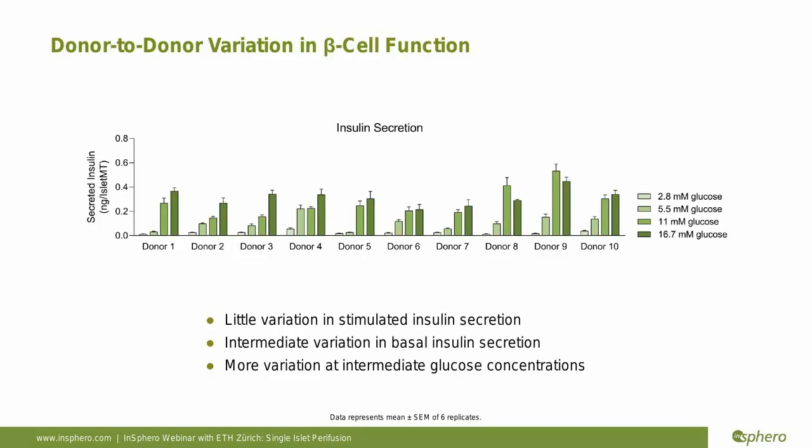Another problem that islet biologists generally face is the variation in islet function or beta cell function between different isolations. We know that this is generally due to the quality of the islet prep. Once we go through the reaggregation process, we know multiple differences happen, such as exclusion of the contaminating exocrine cells, or probably reformation of the islet architecture, and we actually obtain a very robust glucose-stimulated insulin secretion from all the donors we have tested.